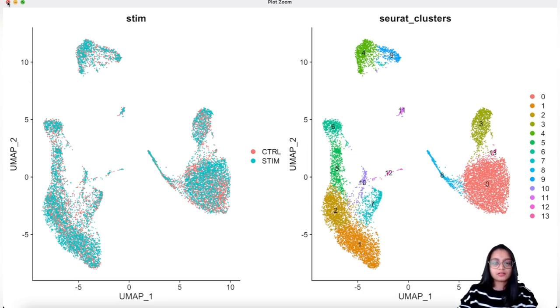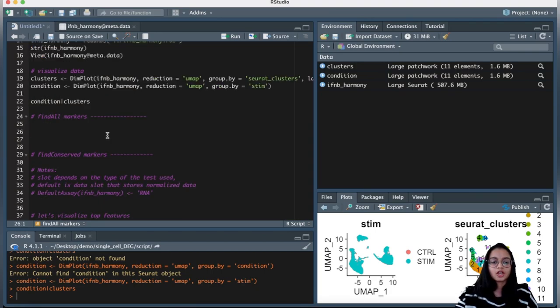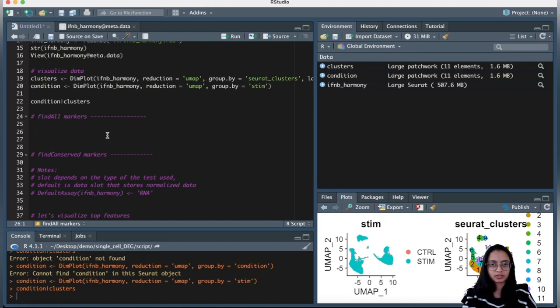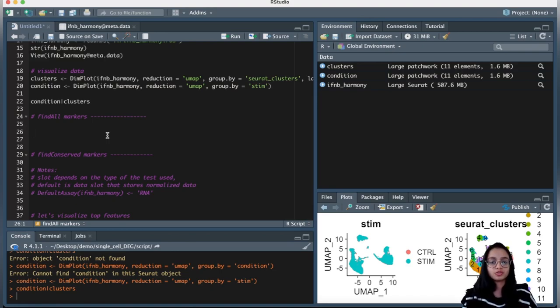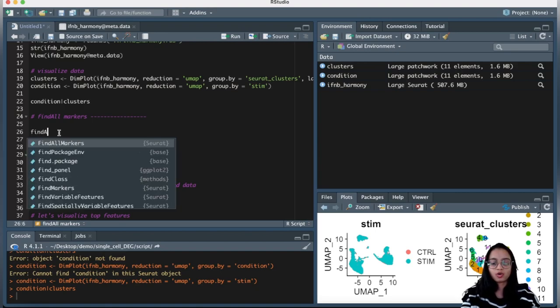Let's start by identifying the cell types that form each cluster. There are two functions that can be used for cluster identification: FindAllMarkers and FindConservedMarkers. As I mentioned in the presentation, FindConservedMarkers is more applicable to a scenario like ours where we have data from two conditions with cells present in both. FindAllMarkers is more appropriate for data from just one condition or one group. We will not be using FindAllMarkers for our cluster identification, but I still want to show you how to use it and discuss the commonly used parameters.